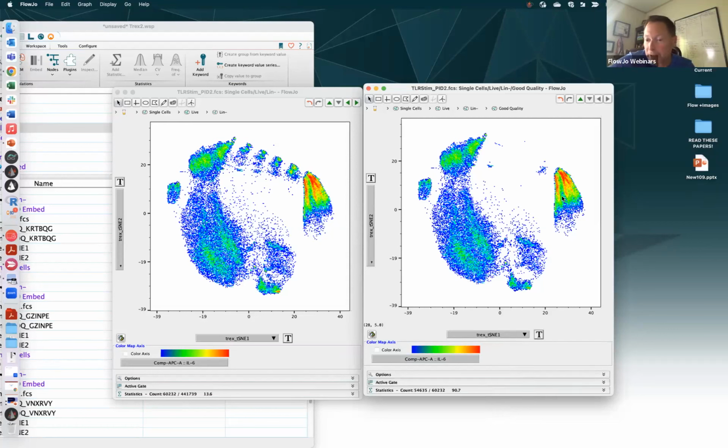So we've now got directly comparable dimensionality reduction parameters on a data set that we didn't bother to actually calculate them with at the same time. So I'm really excited for that one. I think that's a tool that will really make using these high dimensional workflows everybody's been producing very actionable, in that you can learn something on a pilot experiment, and then just keep forward propagating that knowledge without having to go back and concatenate everything together and produce some kind of giant file.